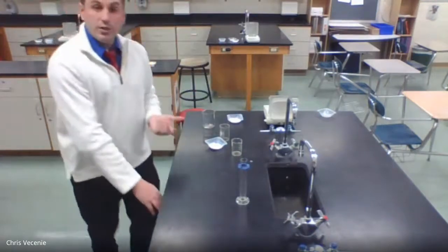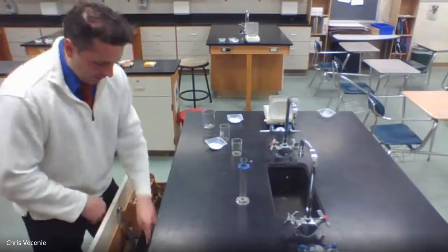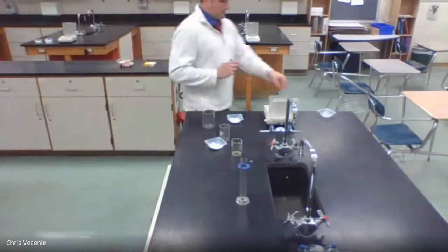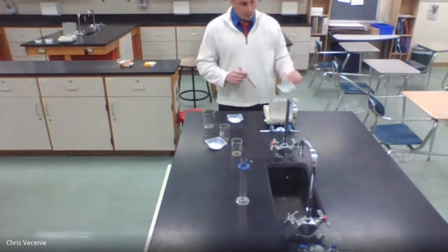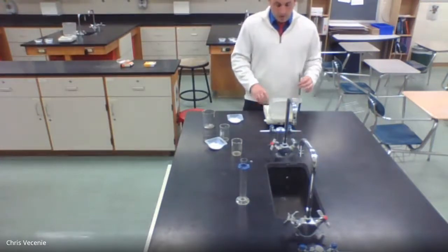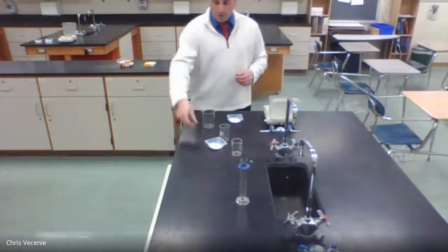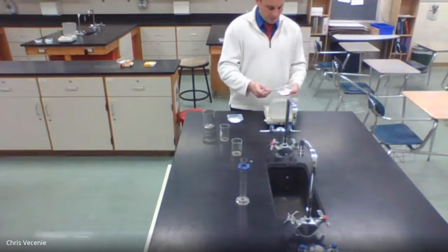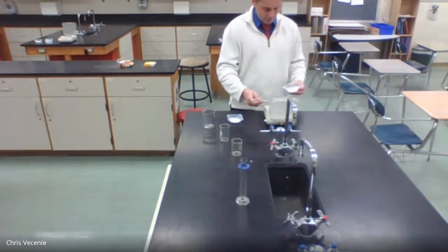The first thing I'm going to do is get 0.75 grams of each, using my scoopula and an empty weighing dish on the balance. I'm going to put the weighing dish on the balance and zero it out because I don't want the mass of the dish. Then I'm going to transfer 0.75 grams.